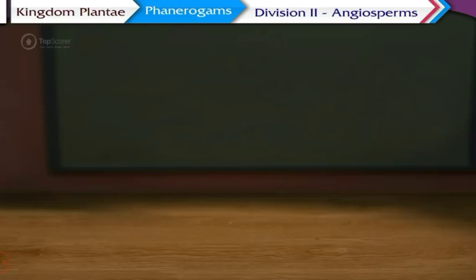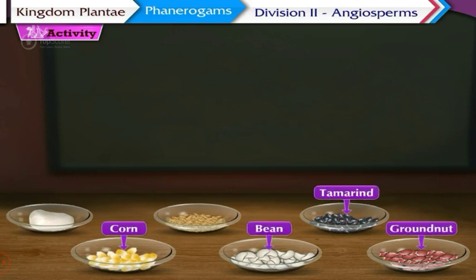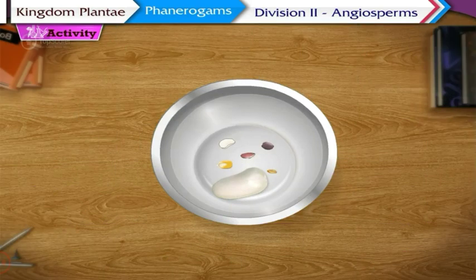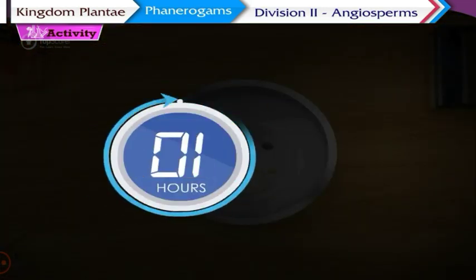Come, let us perform a small activity to learn more about angiosperms. Take some seeds of corn, bean, groundnut, tamarind, mango and wheat in a bowl. Add sufficient amount of water in the bowl to soak the seeds and keep the bowl undisturbed for about 8 to 10 hours.